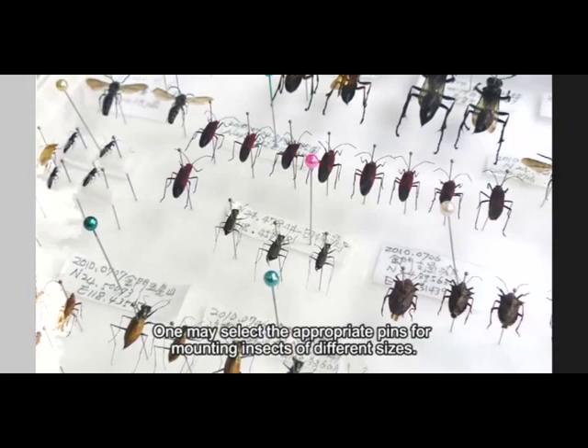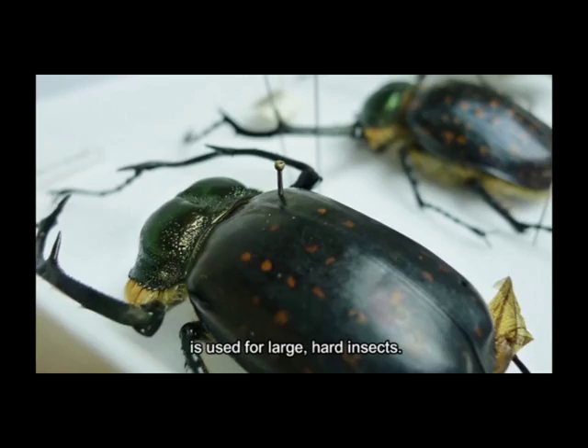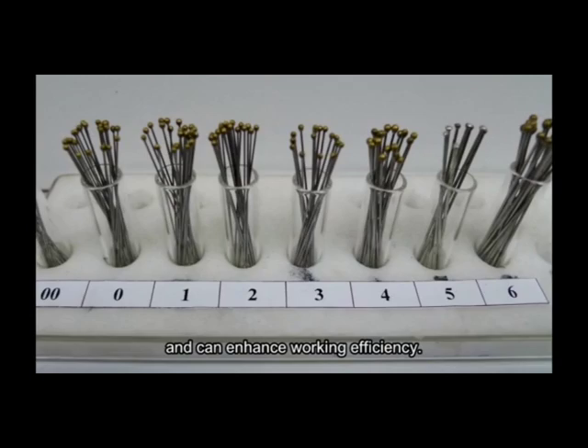One may select the appropriate pins for mounting insects of different sizes. For instance, pin size 00, the smallest pin, is used for tiny, soft insects, while pin size 6, the largest pin, is used for large, hard insects. Because the size of specimens vary, insect pin holders may be useful for holding pins of many sizes and can enhance working efficiency.